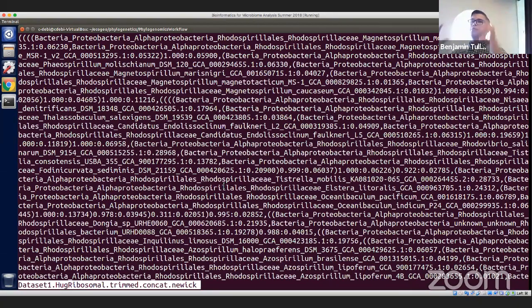Every set of parentheses is giving some distance information between 2 points, right? And so if you find 2 parentheses that only have 2 items in it, and then a number, it tells you how far apart those 2 names should be on the tree. And then when you import it to a tree program, it is able to draw a line that solves that problem for you. There's also information here about your bootstrap value, which will be displayed on the tree as well, so all that information is there.